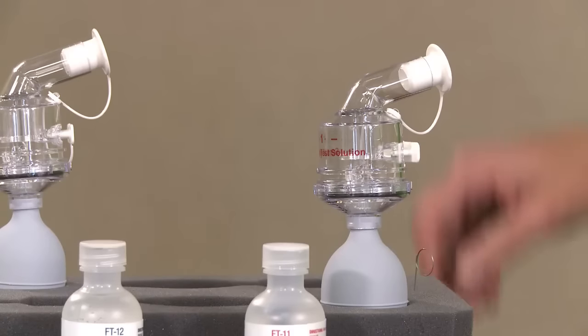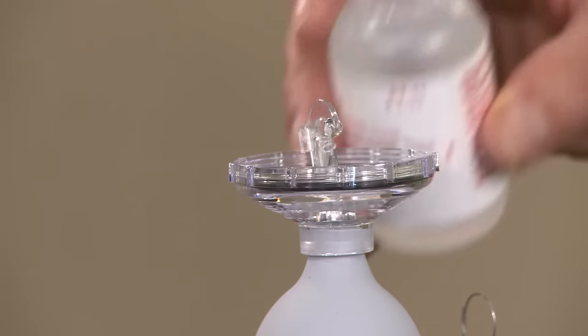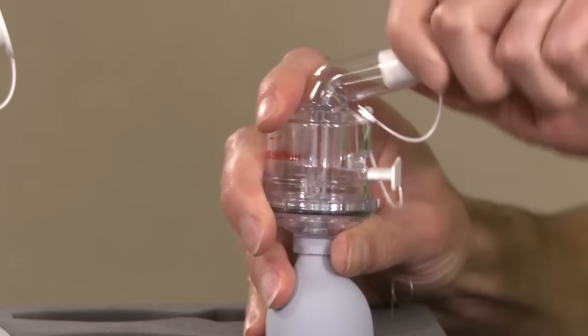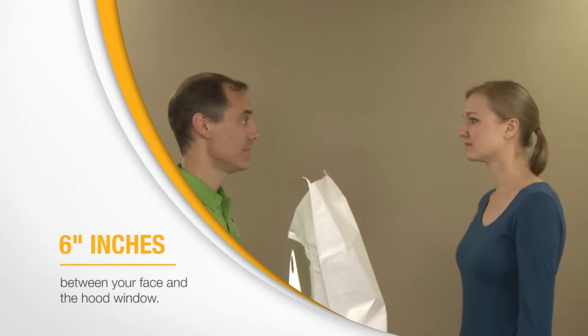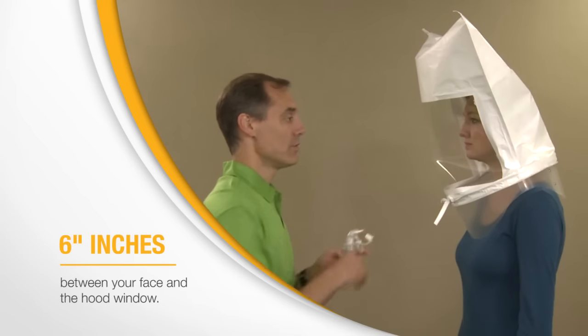The first step is a sensitivity check. It establishes your ability to taste the test agent. You don't wear your respirator for this step. Your instructor will place a hood over your head, positioned so that there is a space of about 6 inches between your face and the hood window. This allows free movement of your head.